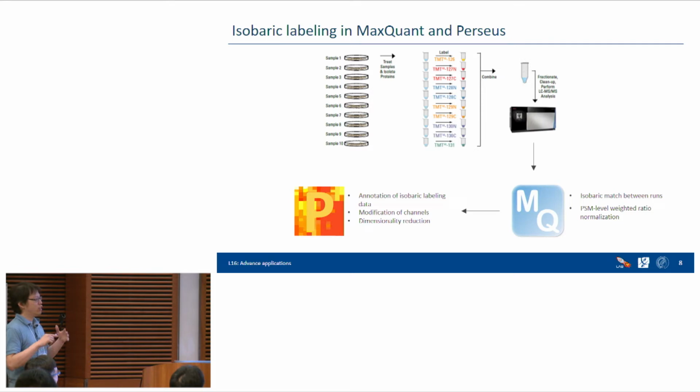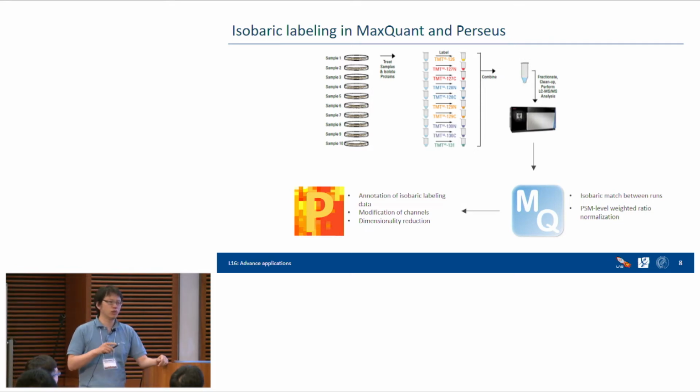And yesterday we heard a very amazing talk from Nikolai. They use TMT labeling for single cell proteomics. So I just showed a picture of the same. Actually, they have the carrier channel, so in each of the other plexes they can put a single cell. Basically, they use this carrier channel, and this information helps the single cell signal to be recovered.